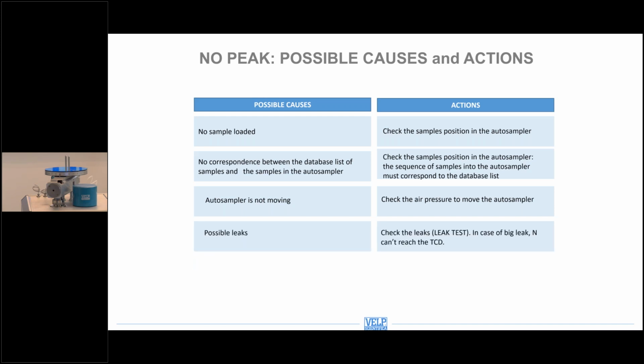Again, we recommend to check for possible leaks, because if any leak is present, the carrier flow with the combustion products cannot reach the TCD. So no peak will be recorded.